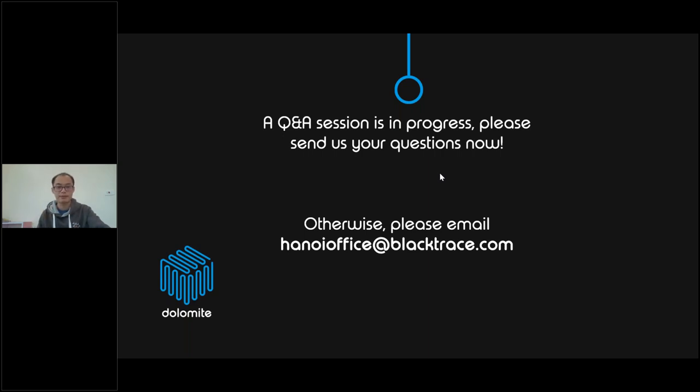Hello everyone, my name is An and I'm the representative of Dolomite Bio. It's the sister company of Dolomite Microfluidics. So we also have some experience with encapsulating single cells in hydrogel. And like King has mentioned, it's totally dependent on your application. For example, for our customers, when they want to encapsulate single cells, they prefer agarose. Or for example, if they want to sort the cells afterward, after you do the single cell encapsulation and then you want to detect some signal in the bead, maybe you can co-encapsulate your B cells with a bead with antibody, and then it will fluoresce once the cells secrete some specific proteins that you are interested in. Then if you want to do that type of sorting application, many people use agarose.